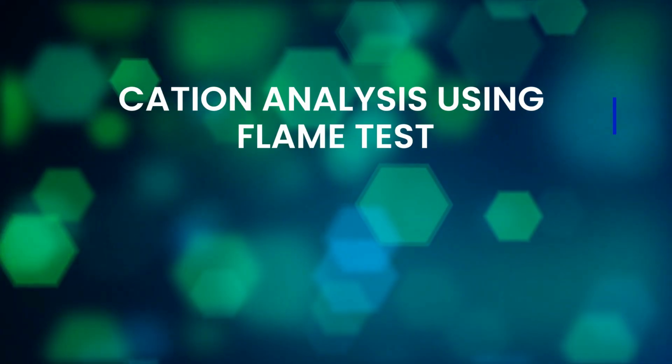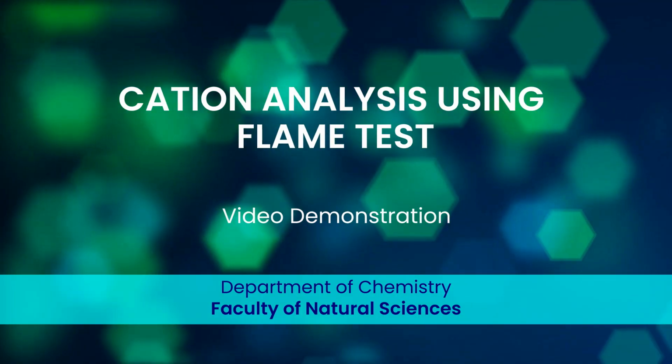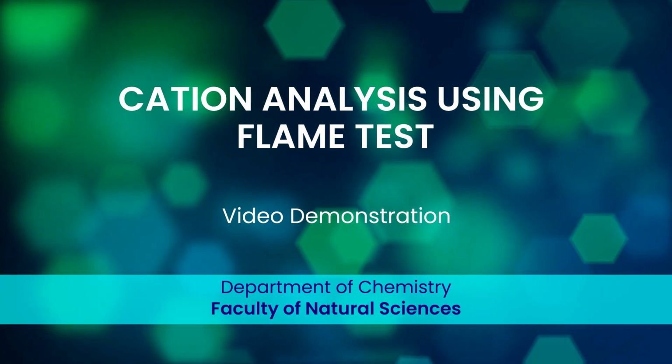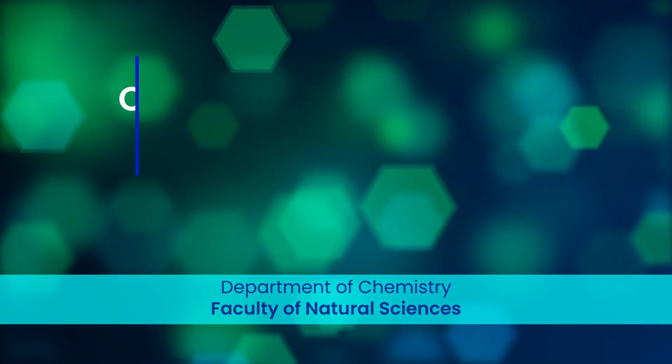Hello, everyone. In this video, we will demonstrate how to identify metal cations using the flame test. Presented by the Department of Chemistry, Faculty of Natural Sciences.